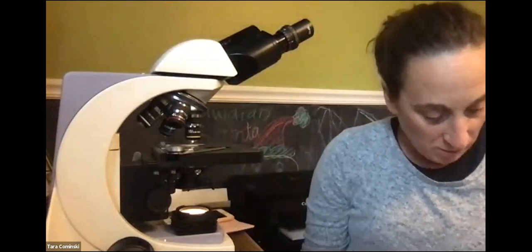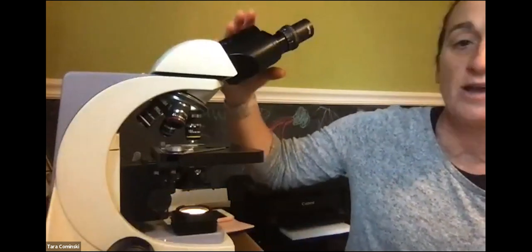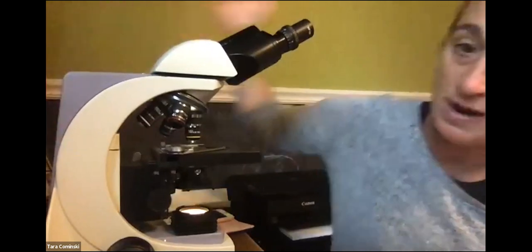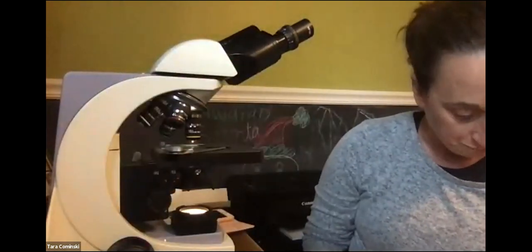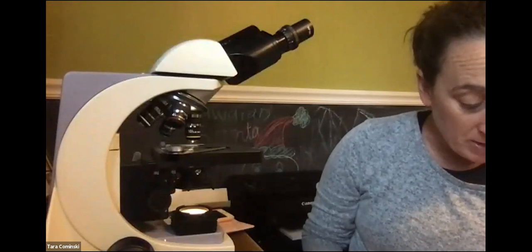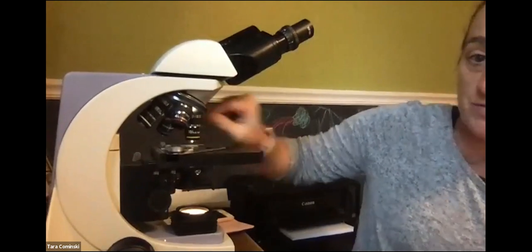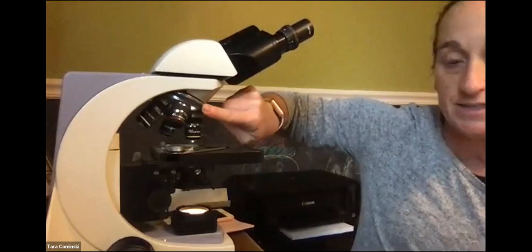All right, if we move through here, the viewing head basically holds these ocular lenses, that's here. The arm is here, right? This is what's supporting the rest of the microscope. Nose piece, a revolving device that holds the objective. So this is the nose piece. If you see here, it can rotate, right? And that's holding those objective lenses.